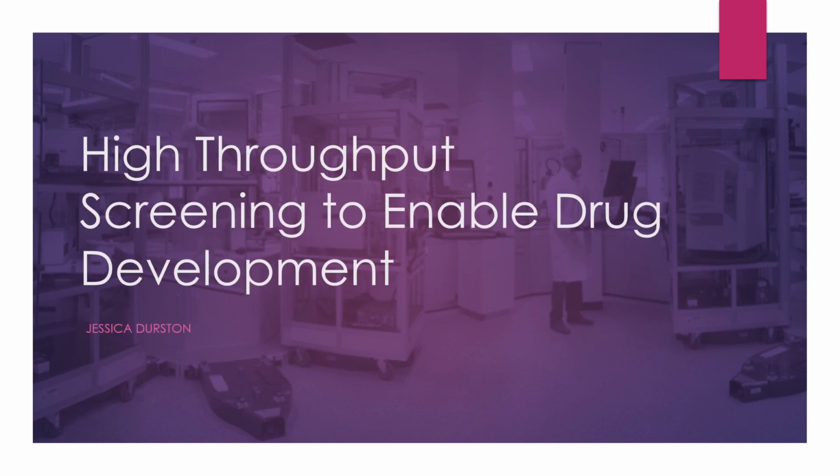I'm going to be speaking to you today about high throughput screening for drug discovery, specifically what it is and how it is being used, what are the advantages and what are the limitations of using this technique.